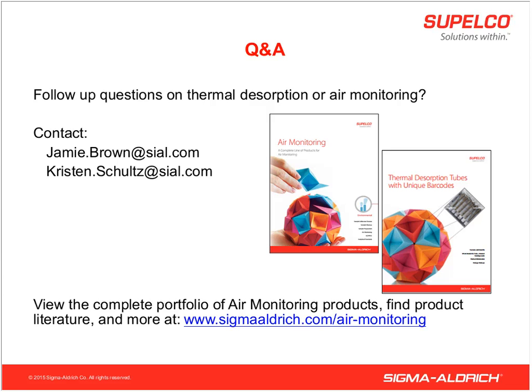Another thought came to my mind. We can add a typical 37 millimeter filter in front of the tube to trap those particles, and you can choose whether to analyze them some other way. If it's a very dusty environment, you could put a pre-filter on and just throw away the filter and then just desorb the tube.